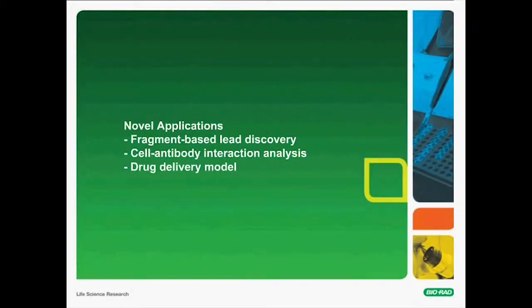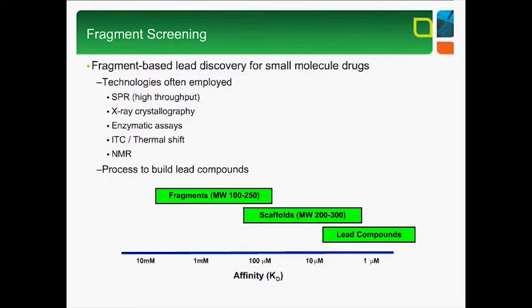Okay, now let's talk about the recent novel applications that have been applied on the ProteOn XPR36 system. And we will go through the fragment-based lead discovery, cell-antibody interaction analysis, and a novel drug delivery model. Fragment-based lead discovery or fragment screening is a popular methodology for the discovery of small molecule drugs.